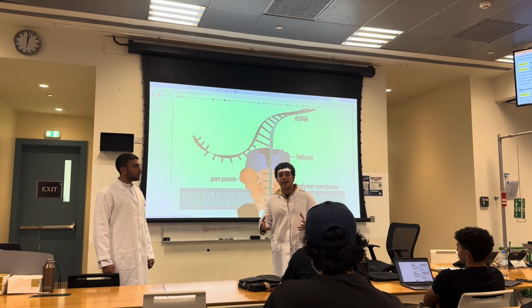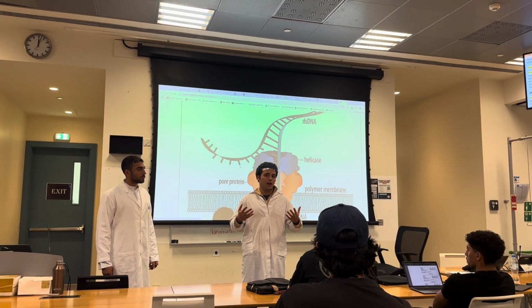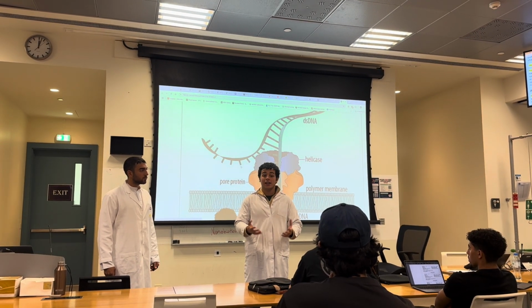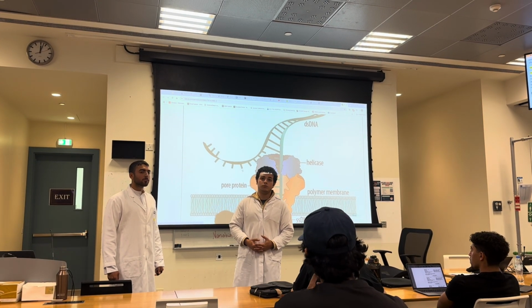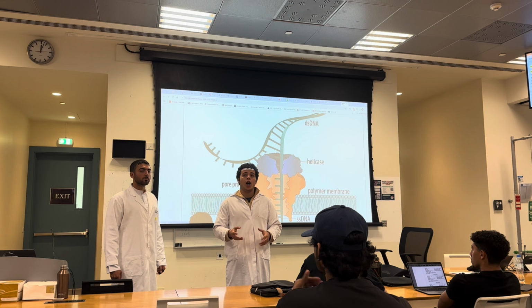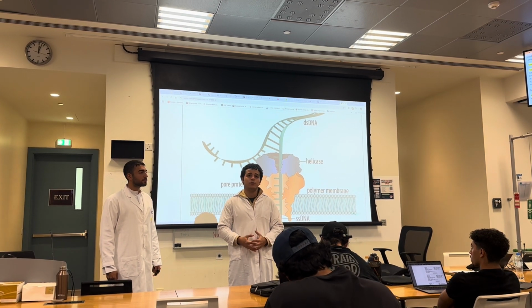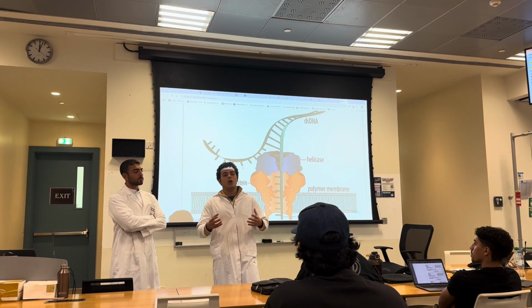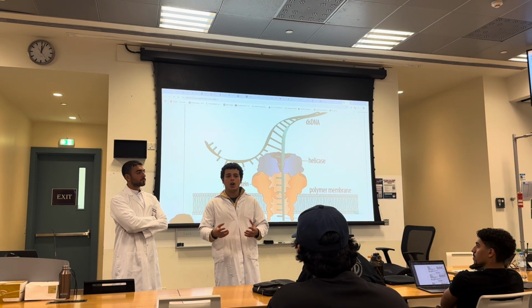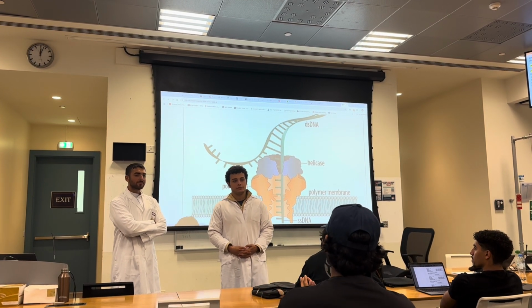However, synthetic nanopores, like those made with graphene and silicon nitride, are being explored in academic settings. These synthetic alternatives are more durable, and they can also be customized for specific applications. But they currently lack the molecular level accuracy of biological nanopores. Thank you so much, Professor.